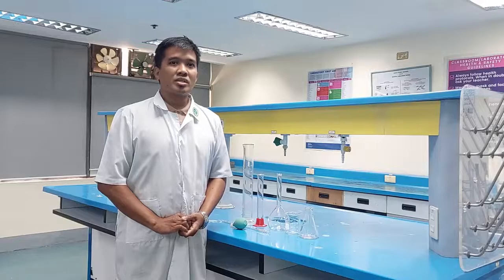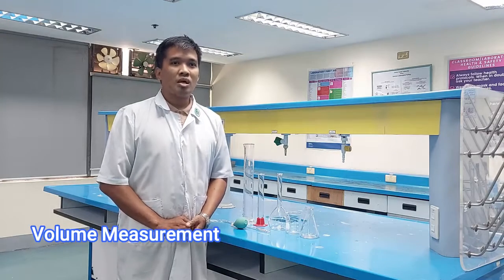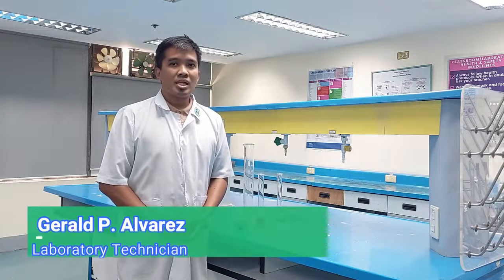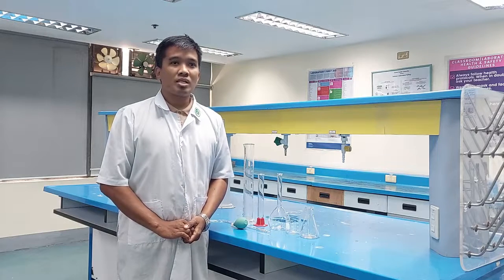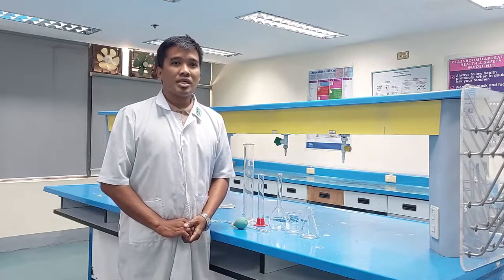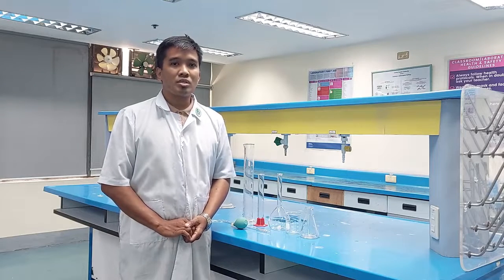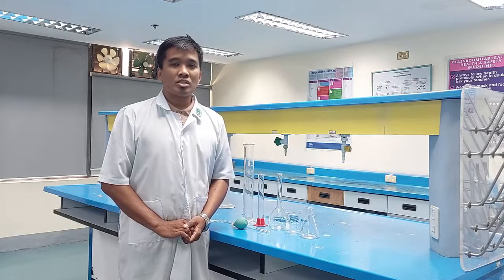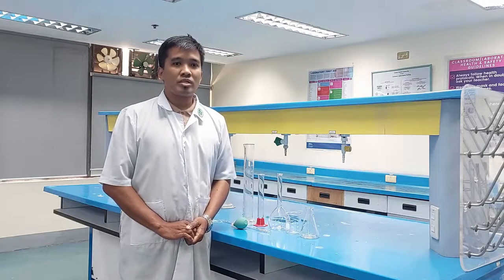For the next measuring technique, we will focus on the volume measurement of liquids. Volume can mean how much space something takes up. In the laboratory, the tools for measuring the volume of liquids are generally made from glass, plastic, or occasionally metal, although scientists refer to all of them as glassware. Scientists and chemists in particular have a variety of glassware at their disposal for measuring volumes. The particular piece of glassware chosen in any situation will depend primarily upon two factors: the required volume and the accuracy required for the measurement.